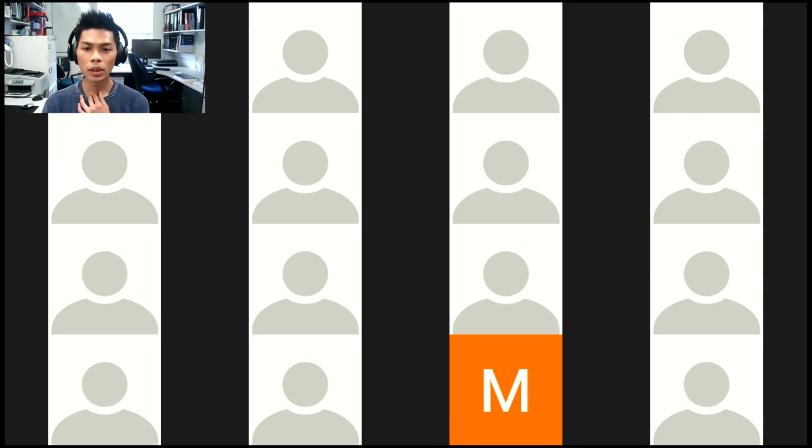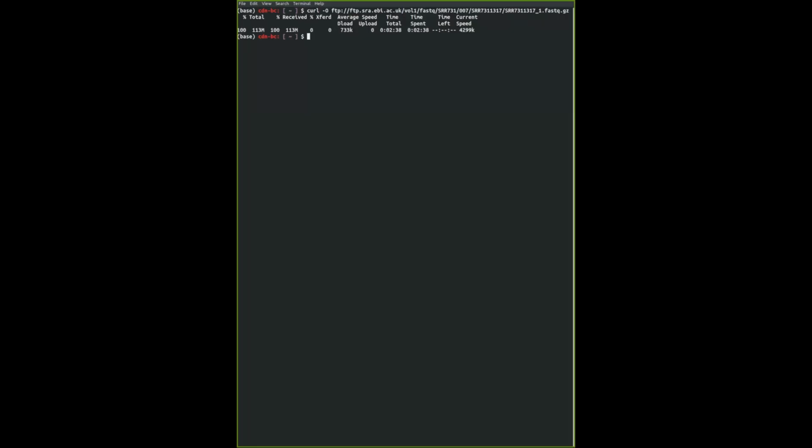Okay, so give this a while. It's okay. I'll give you some time. Even if not, just do it in the background. Again, I'll paste the code as we go along, and then you can pick up from where you are. Even mine took quite a while. So next session, I'll get you to download this before the class, so we have the files already for the class. Okay, we can go on and download the other read pair by doing the same thing, but I'm not going to do that just to save time.